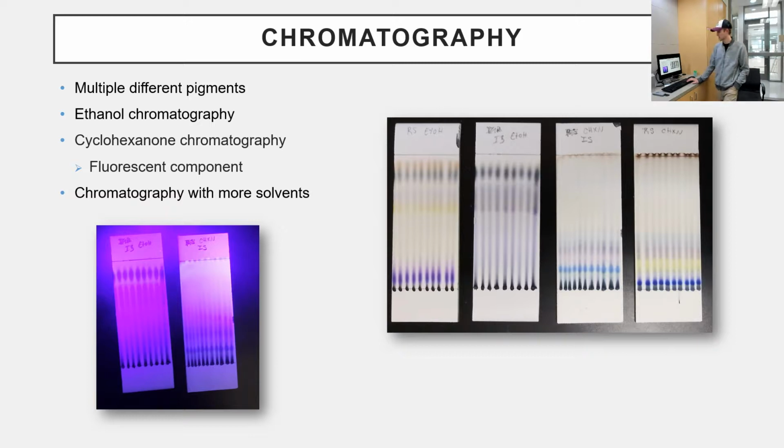Well, I guess I could try it with different solvents. And no Sharpie, so you just elute it, do a blank. Elute the solvent up to the line. You have one with the Sharpie on it, one without. Oh yeah, well, I did that.